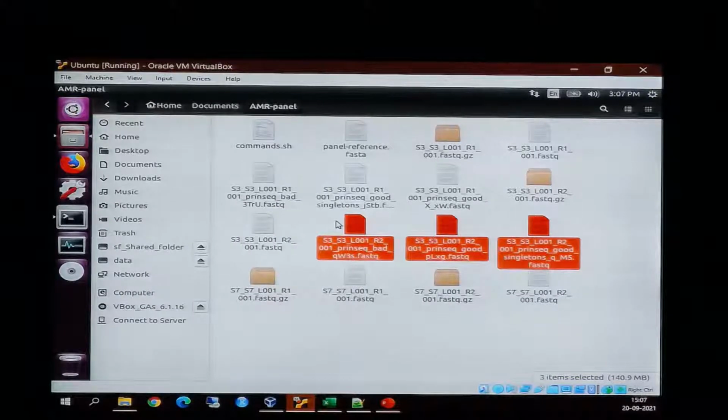The next step that we are going to perform is merging of the reads. Over here, our library size was very broad, but the fragments, our amplicon targets, were ranging from almost 75 to around 290, something like that. Even if we have opted for 250 paired end chemistry, there are a few amplicons which have overlap and are not completely covered by R1 or R2 alone. So we need to merge our sequences.